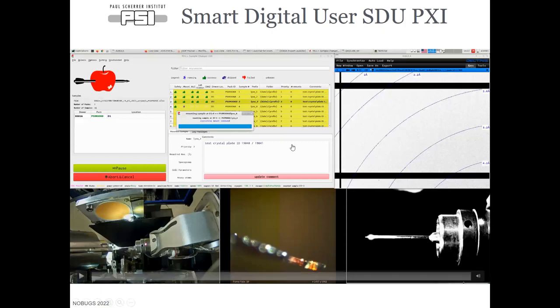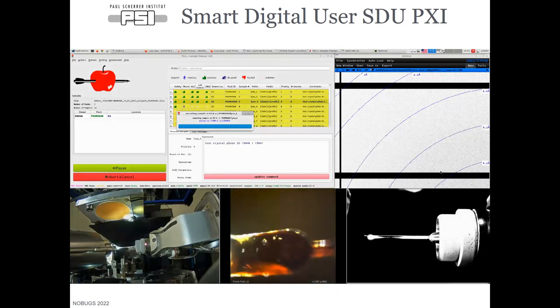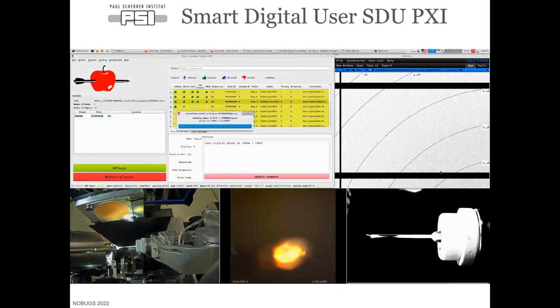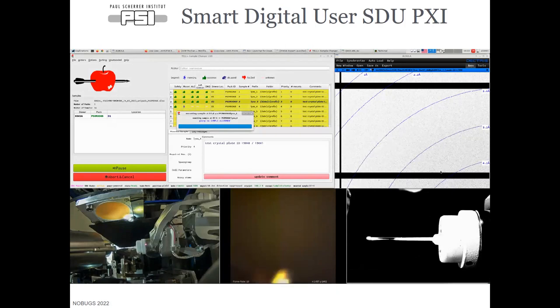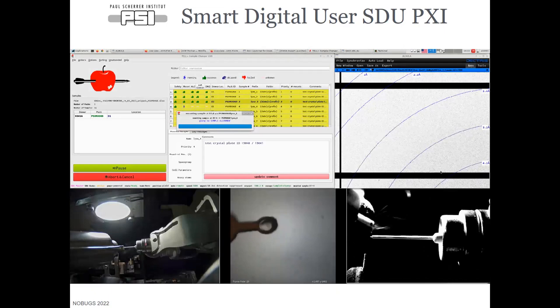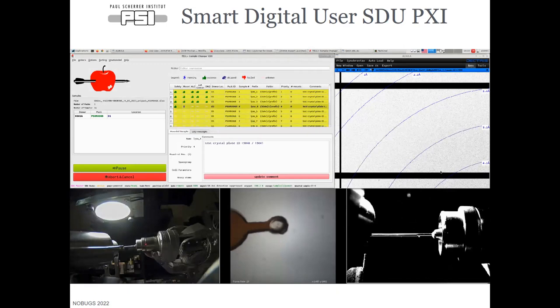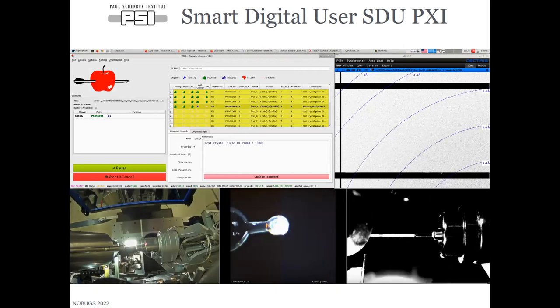Rather than a live demonstration, I'll play a video of our PX1 beamline from earlier in the year with our Smargon installed. We can see our robot has come in to mount our sample, and as this happens our pre-location in the bottom right has already started to try and align our sample to our rotation axis. The TEL GUI updates show it going to sample alignment. Now our sample is in focus in the bottom middle, so we start aligning — rotating, fitting our sinusoid to get the largest area, flat face thickness. The bounding box information gets sent to the Smart Digital User, which uses those coordinates to calculate where to do our raster scan.